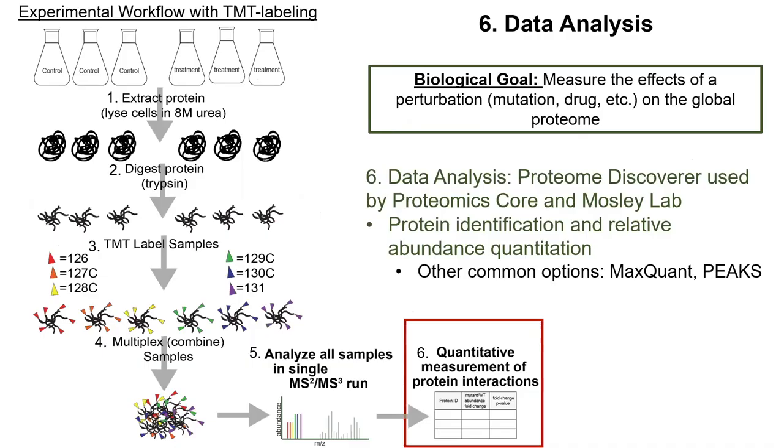Okay. So for data analysis, we're down to five minutes. Yeah, I just have a couple more slides. So we use Proteome Discoverer. There are other options, say MaxQuant is open source, so if you would like to try any of this yourself without purchasing anything.